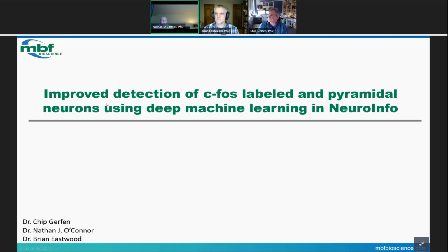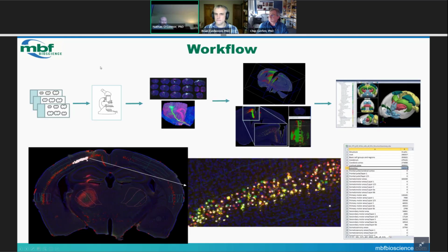Brief introduction of what we're going to talk about today. This series of webinars has been an overview and then various deep dives into parts of a workflow for getting measures, here cell counts, that can be put into a common coordinate system so that they can be compared and compiled. And here, that's the Allen Average Mouse Brain Coordinate System, or the CCF.